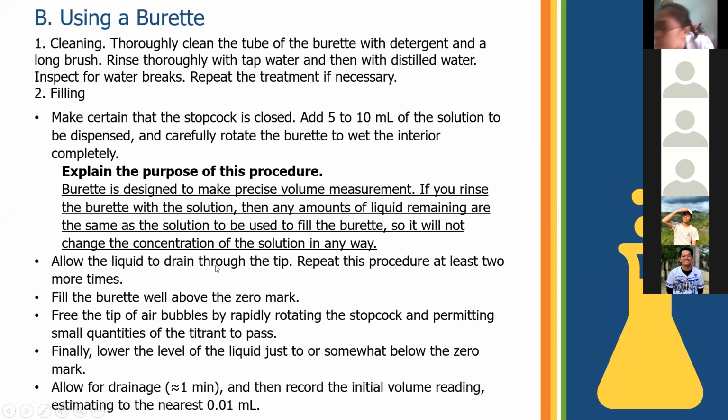So for the filling of the burette, make certain that the stopcock is closed. Add 5 to 10 ml of the solution to be dispensed and carefully rotate the burette to wet the interior completely. So the purpose of this procedure is the burette is designed to make precise volume measurements.